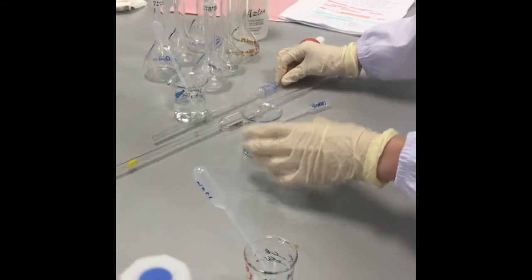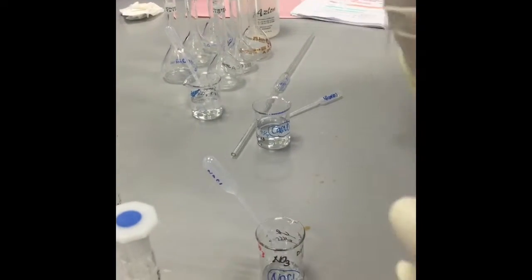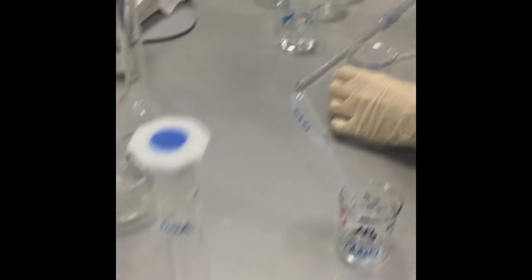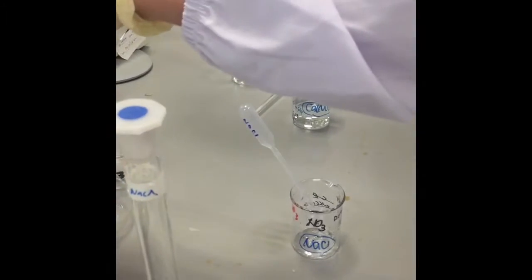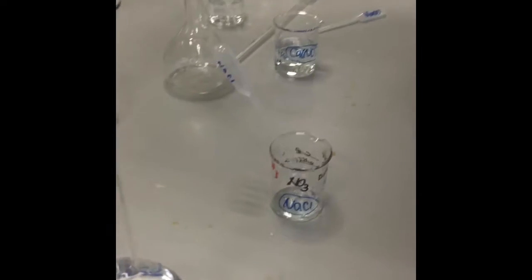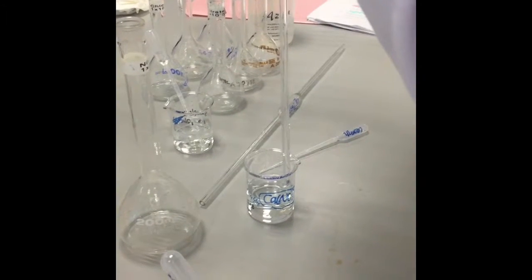So now we're going to pipette 20 ml of solution from the 10 to the power negative 1 calcium nitrate into the volumetric flask for 10 to the power negative 2. Please transfer your solution into a beaker before pipetting, as this avoids any contamination. Andrea is here with me today, and she's going to pipette 20 ml of calcium nitrate from 10 to the power negative 1 to 10 to the power negative 2. Please do the same for your sodium chloride with 20 ml.